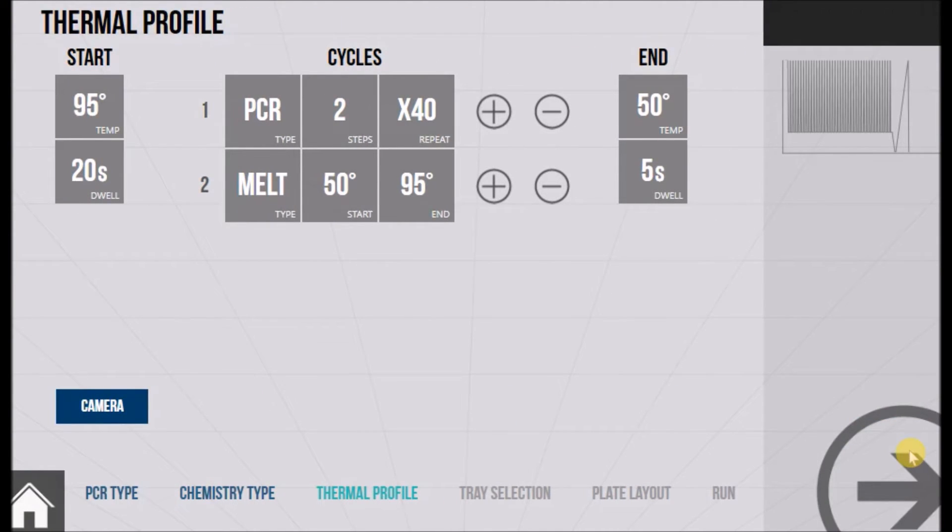Here the thermal profile is designed. As you can see it's split into three sections: a start or initial denaturation, the reaction itself, and the end. The end section is in place to bring the plate to a temperature cool enough to touch ready for when it's removed from the machine. Simply touch any of these sections to alter the parameters.